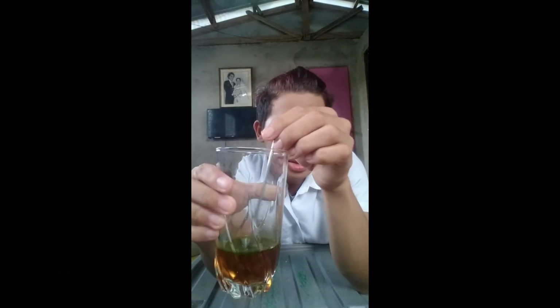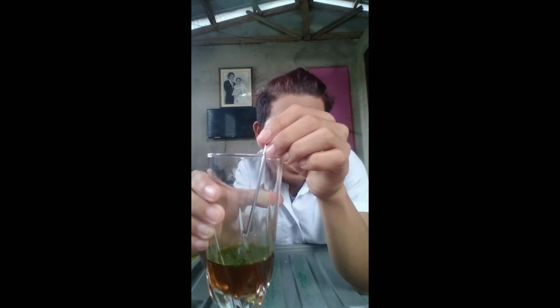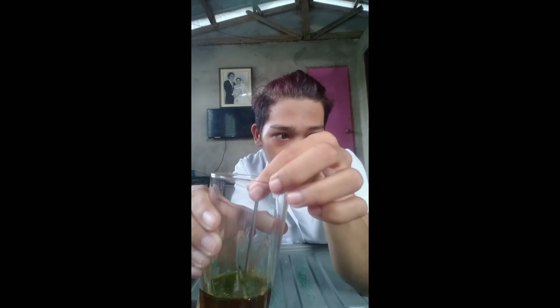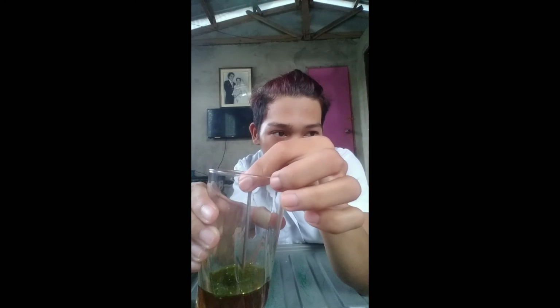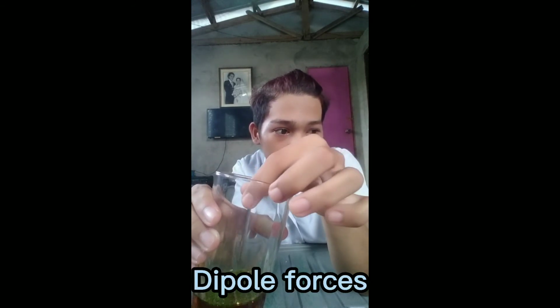The sodium ions and the chloride ions are strongly attracted to the water molecules, so that's why the color separation takes place. As we can observe, the color mixture becomes two. The mixture of acetone separates from the mixture of the water and food color. As I said earlier, the sodium ions and the chloride ions are strongly attracted to the water molecules, and that's called ion-dipole force.